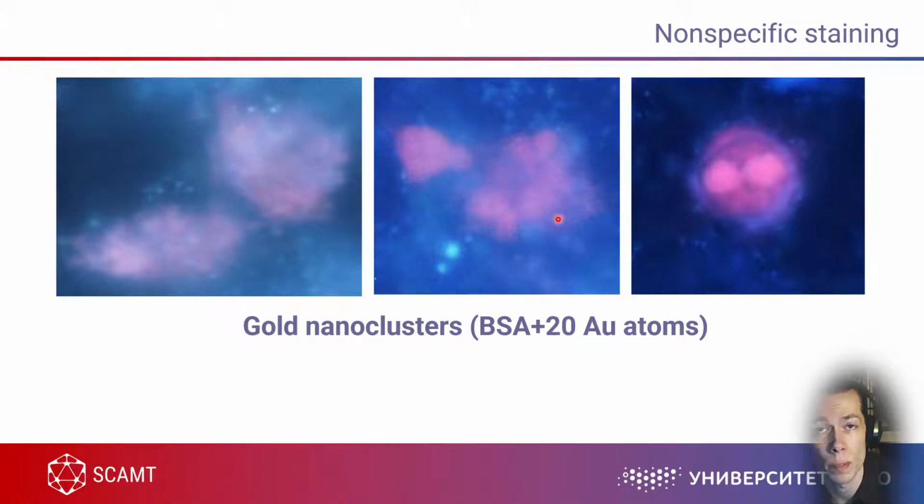And honestly, there is no pink color. If you look at the spectrum of visible light, it's blue, green, yellow, red, infrared, ultraviolet. There is no pink in the spectrum. There is no such color. But why do we see pink? Because pink is a merge between two opposite sides of the visible spectrum, violet and red. When we have both of them merged in the same sample, we see some pink color. So when you stain something, you should perfectly understand how this works, how the cells work, and how the light works to interpret your results.